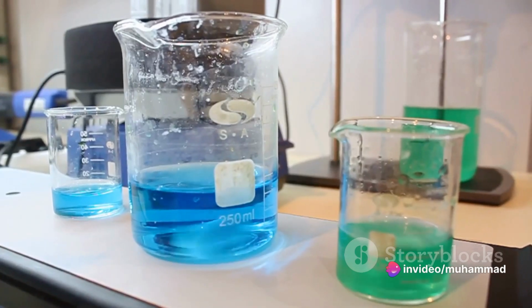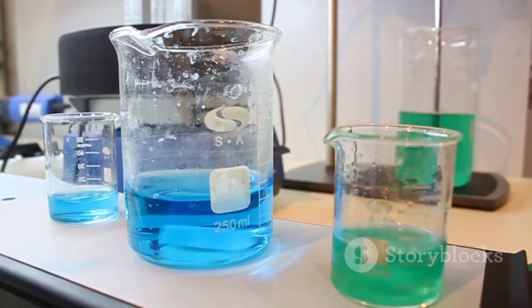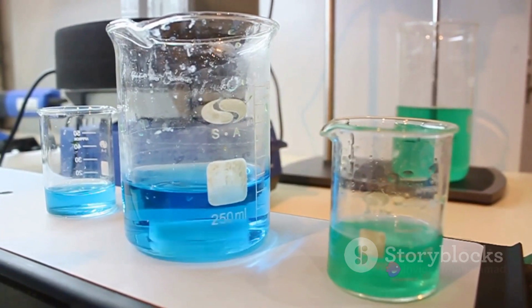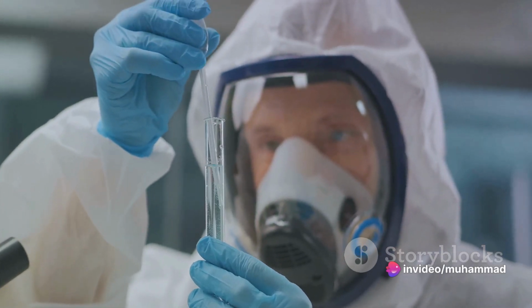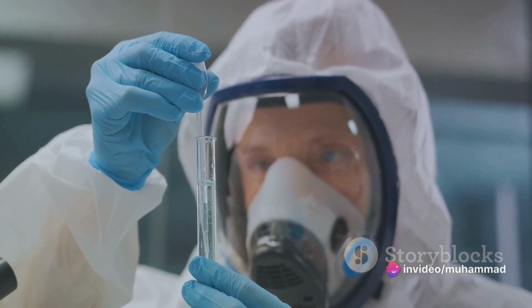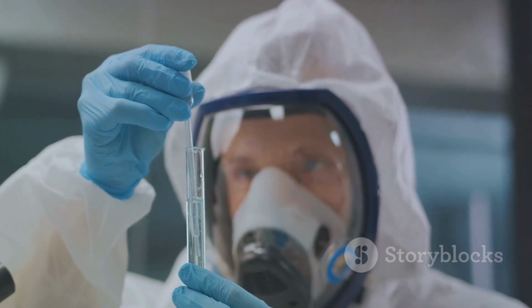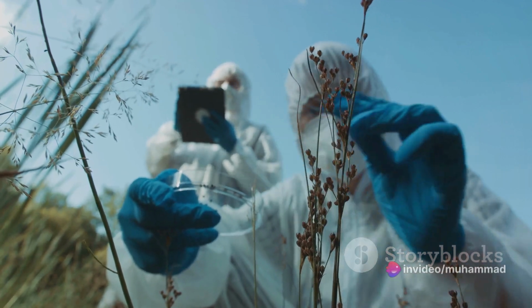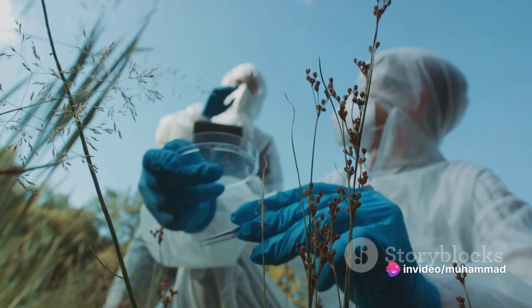Moving on, let's delve into gas chromatography. This type is a hot favorite in forensic science and environmental pollution studies. In gas chromatography, the sample is vaporized and carried by an inert gas, which acts as the mobile phase, through a column with a stationary phase. The varying interactions of the sample's components with the stationary phase cause them to separate. The advantage of gas chromatography lies in its ability to analyze volatile substances and provide high-resolution separations.